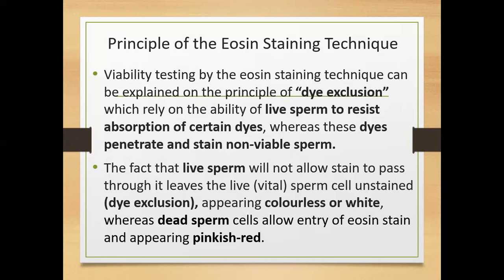You remember that the sperm you saw as though dead is not dead. Is the cell membrane dead or not? It's not dead.